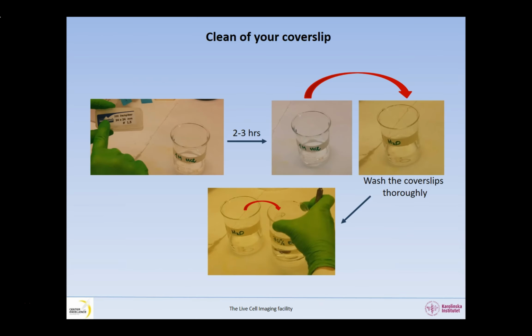It is important that the cover slip you use in fluorescence microscopy be extremely clean. Although cover slips look clean, especially when a new box is first opened, they may have a thin film of grease on them that will not allow tissues or culture cells to adhere well, and that may interfere with some processing steps and ultimately with your imaging. Therefore, cover slips should routinely be washed with acid or base solutions to get rid of this thin film.